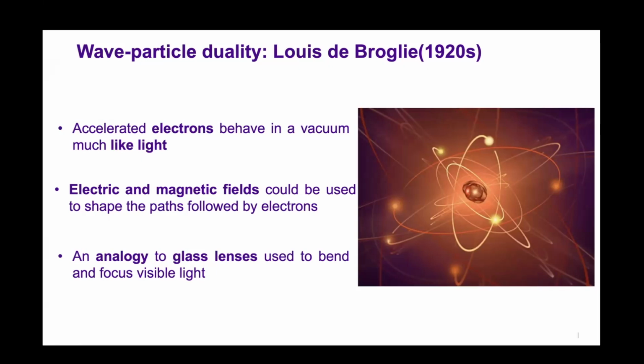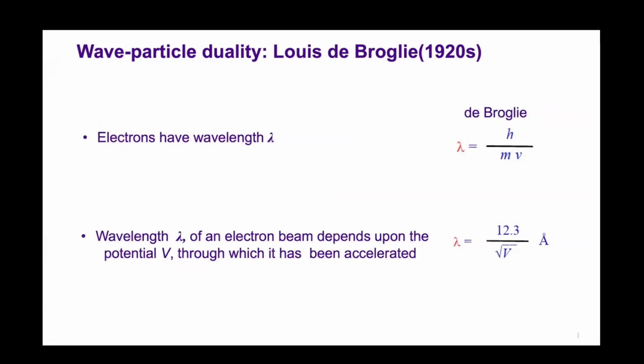Now the idea comes: can we use a beam of electrons instead of light? Because electrons can have a smaller wavelength. Smaller wavelength means higher resolution. But the challenge is how to use that, right? So electrons have a certain wavelength. You can use all this equation, but now how to use this electron and create this beam?